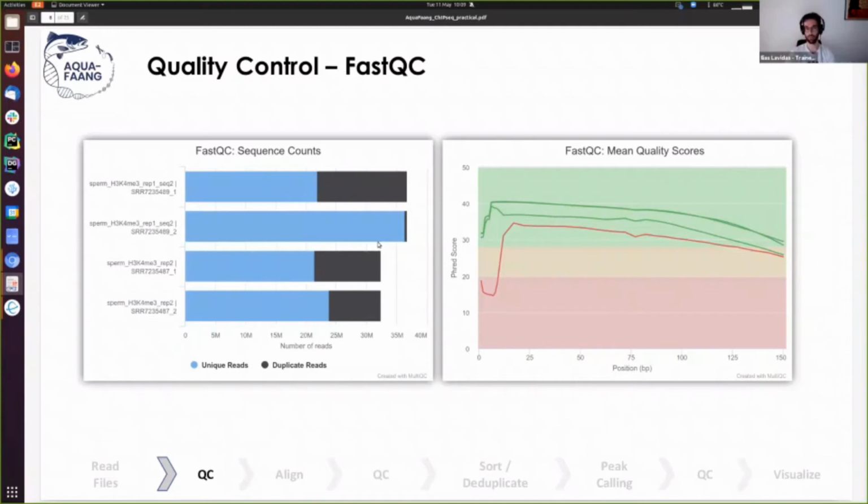So the most popular tool for QC after the sequencing step is called FastQC, and it actually is a set of several metrics. So now I'm gonna step out of the presentation, because the images that you see here come from a very nicely formatted HTML document. You can also find this document in the living Google document that Thomas and the rest of the training team has provided.